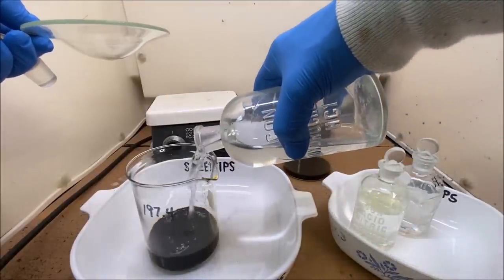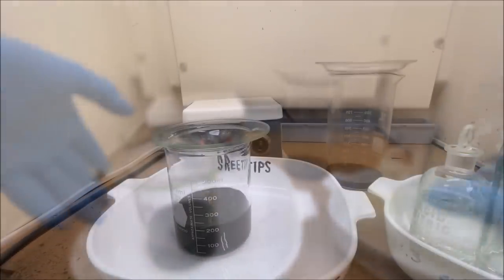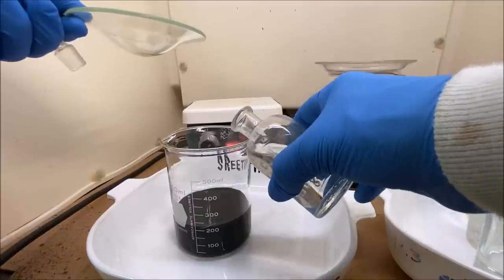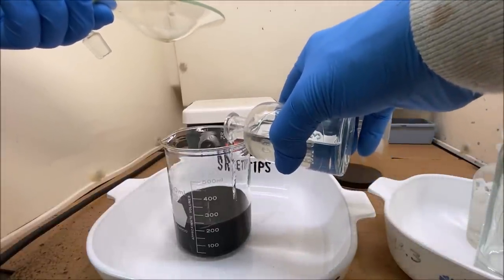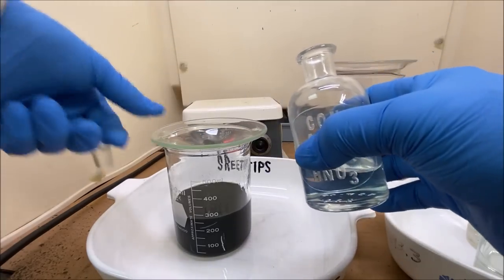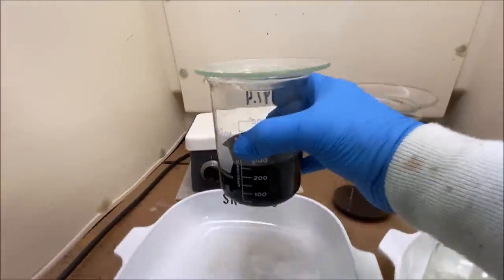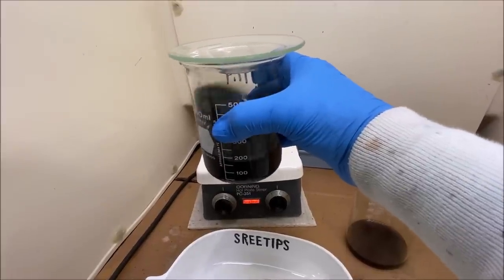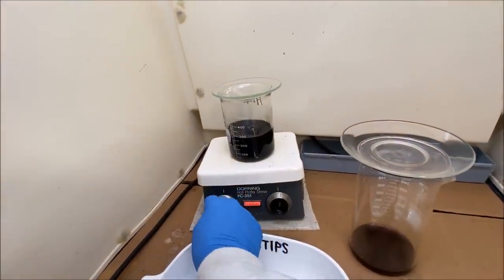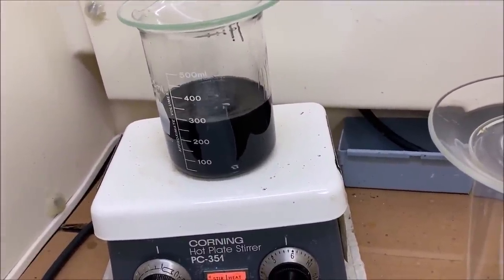I'm going to go with another 200 milliliter charge. Hydrochloric acid. Now I'm going to add some nitric acid. Pour my aqua regia in here. I'm going to hit it pretty good with the nitric to form a good strong aqua regia solution. And now what we'll do, give this a swirl. Set it up on the heat. And there we go.